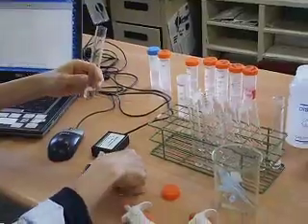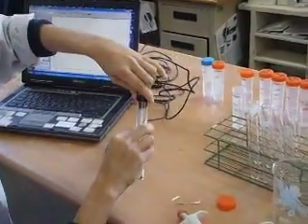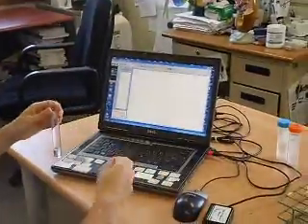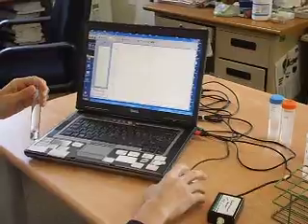This is my magnesium ribbon strip, and before I put it in, I have to make sure that this is airtight. So this is my screen capture. It's all linked now to the Vernier. Pressure currently is 101 kilopascal.